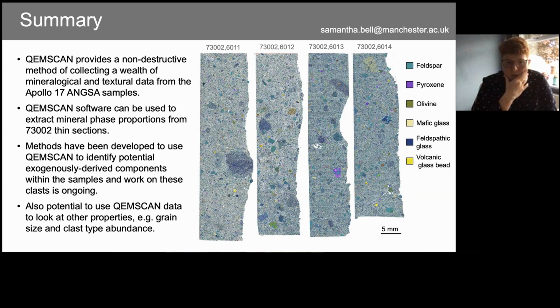Yes, we could. It's one of the options that might be worth looking at with the data. There are certain processes that will separate grains out. One of the issues with samples like this is that the clasts aren't always very easily or well defined. I mean, we could look at them and they're well defined, but in the software it would take a little bit of extra processing, and there'd obviously be some caveats. We'd certainly have to filter out anything that's 1 or 2 pixels in size, so there'd be some limits on that.